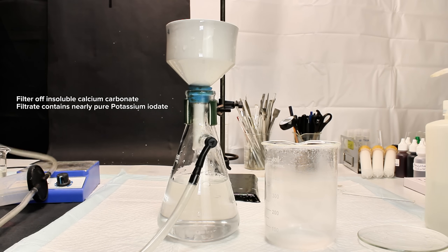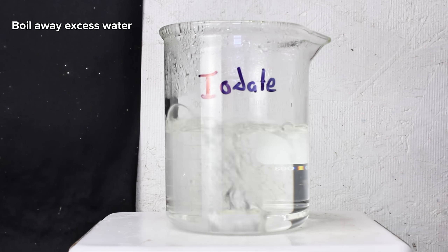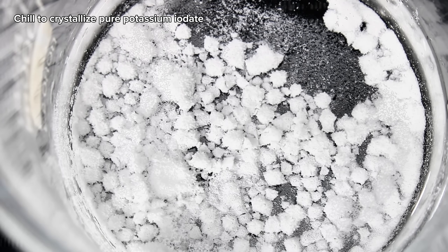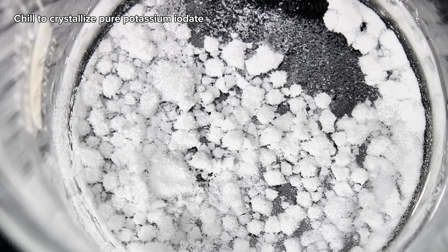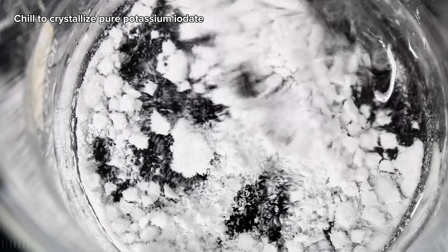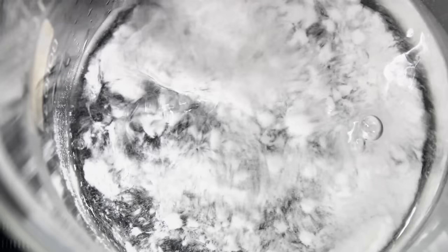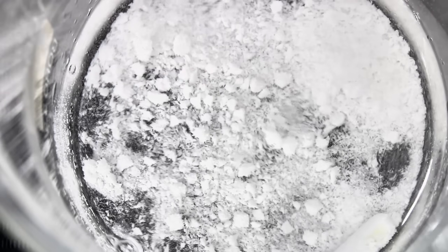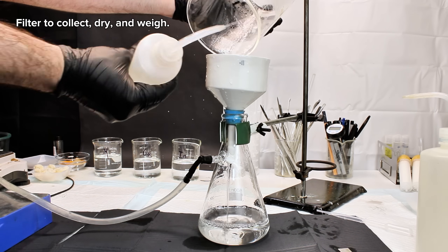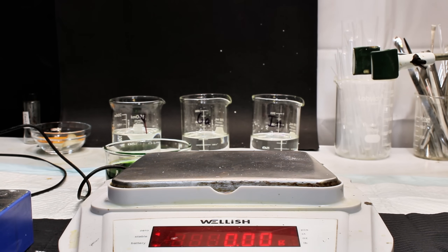After the two had spent an hour reacting, the insoluble calcium carbonate was filtered off, and the filtrate containing mostly pure potassium iodate was boiled down to around 100 milliliters. This was then cooled down to around 0°C to crystallize out the potassium iodate, which was collected by vacuum filtration, dried, and weighed for a final and more realistic mass of 20.12 grams, representing a 94% yield. This is way better than my number from earlier, and this time I'm very confident that what I had was nearly pure potassium iodate.